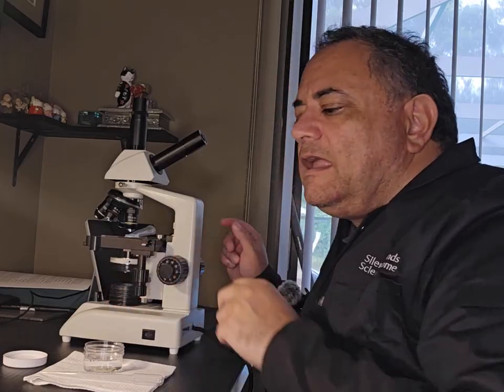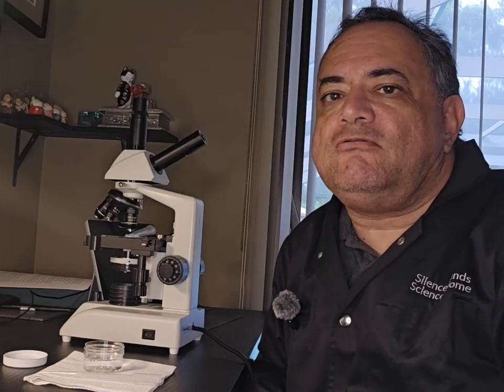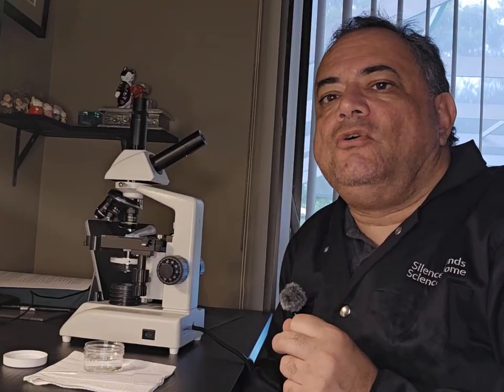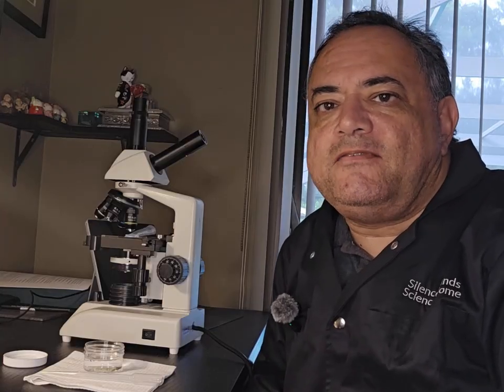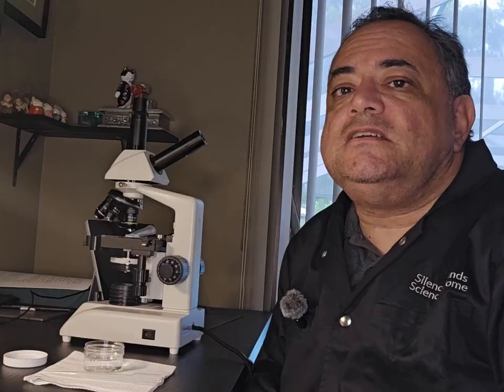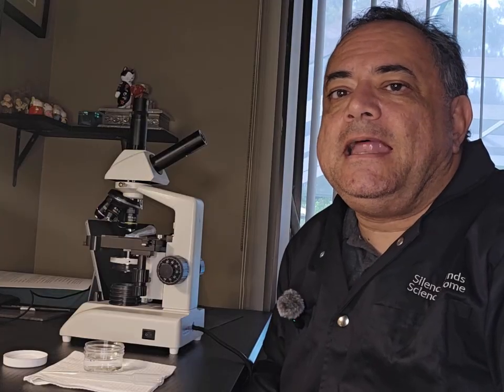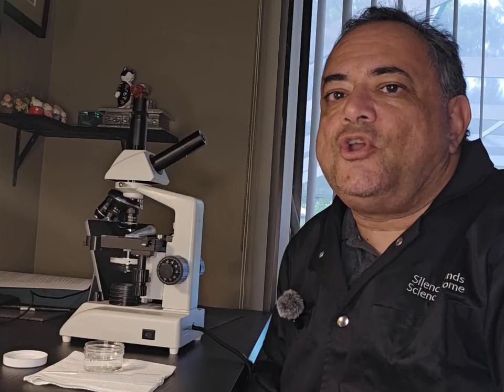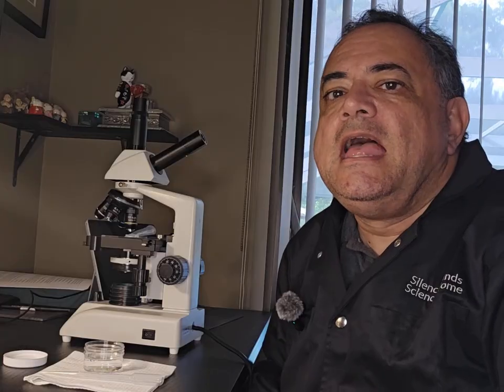But just remember that you could accidentally squash the microorganisms, and tardigrades are quite large. So in order to avoid that, I don't like putting them on a slide with a cover slip. For a higher magnification, I did a water mount on a microscope slide, but I didn't place a cover slip on it. But I was able to go far down enough to focus on a higher magnification.